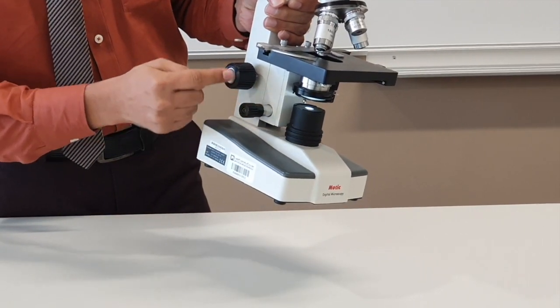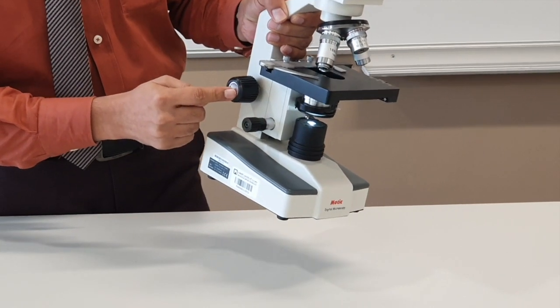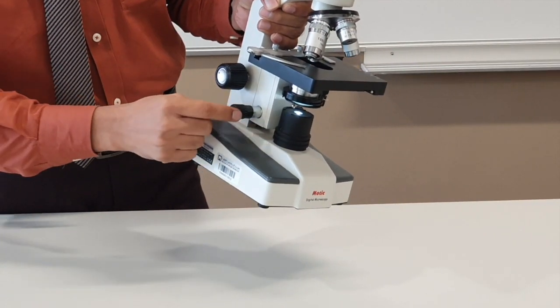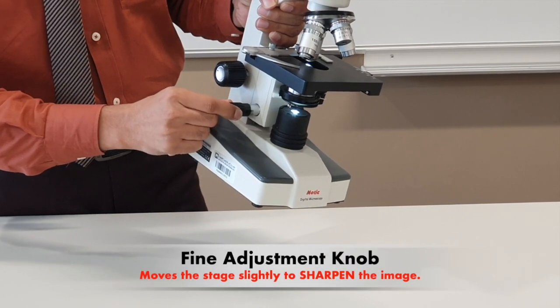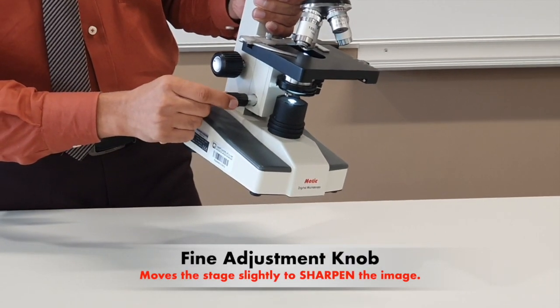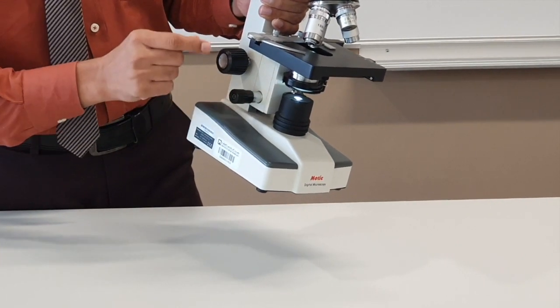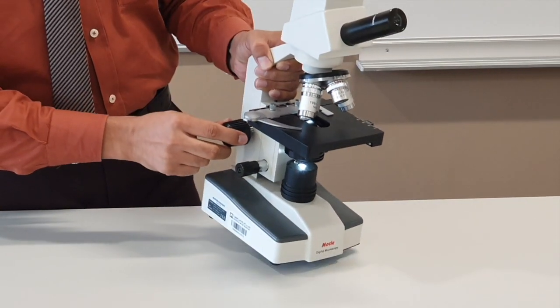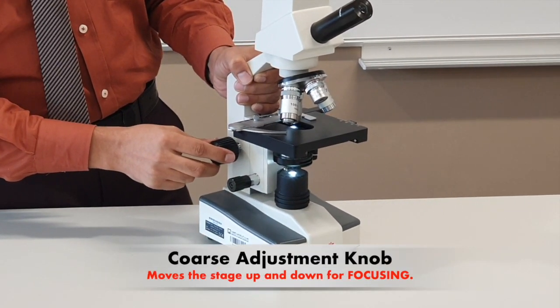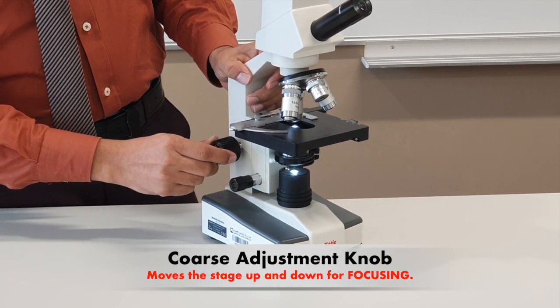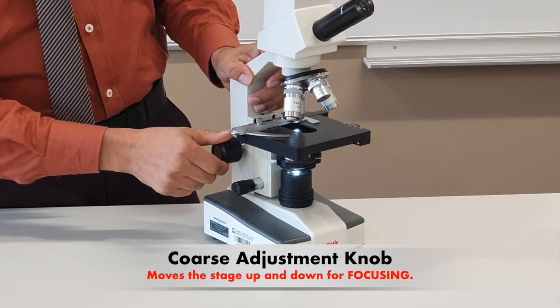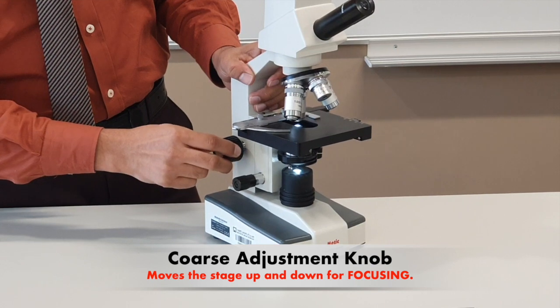You have these two knobs, which are very important for the clarity of the image. The lower one is called fine adjustment. This adjustment is to sharpen the image quality. The other one, the bigger one, is called coarse adjustment. Coarse adjustment is used to move the stage up and down to bring the slide closer to or away from the lens.